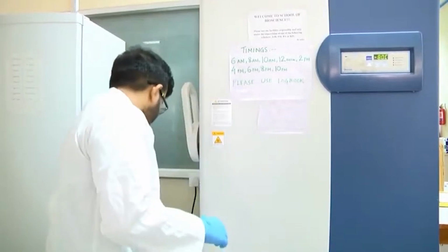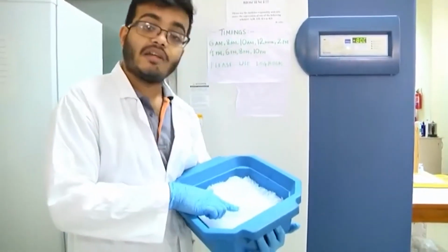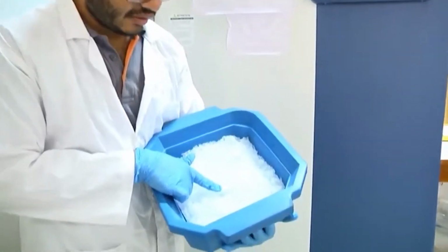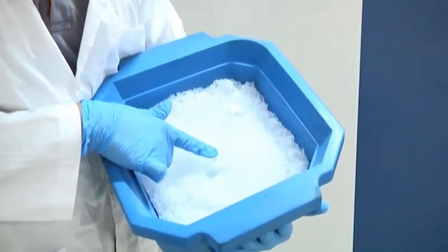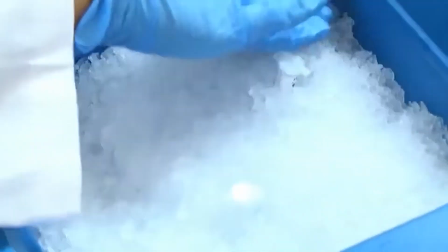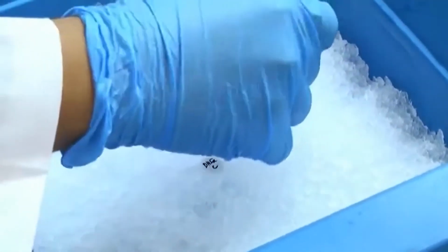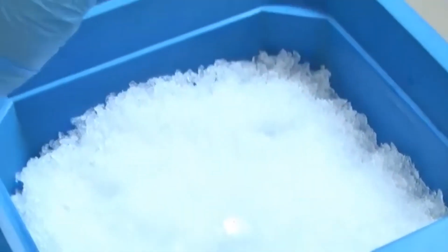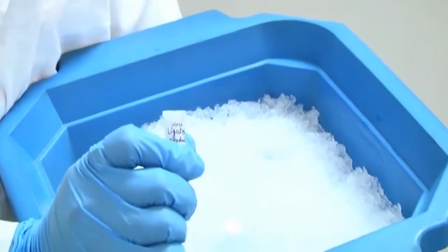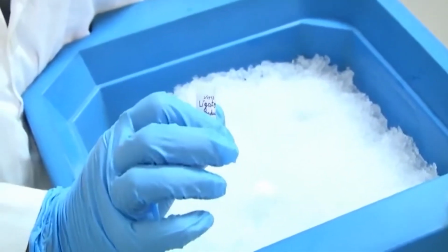That is it. So, what I have here in my ice bucket is a vial containing chemically competent DH5 alpha cells. It is labeled as that, DH5 alpha C, C is for competent. We made this a couple of weeks ago, and if you prepare them correctly, they can be fine for several months. And also in this vial, what I have is our ligation product. What we have already done in our previous videos, we prepared a ligation product.